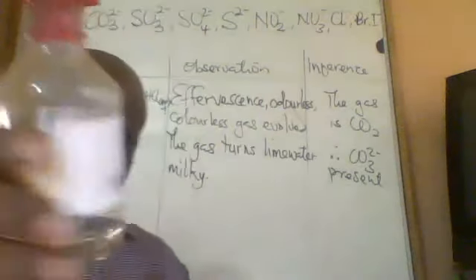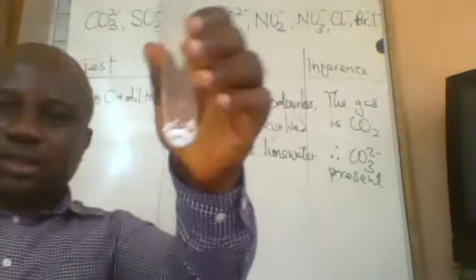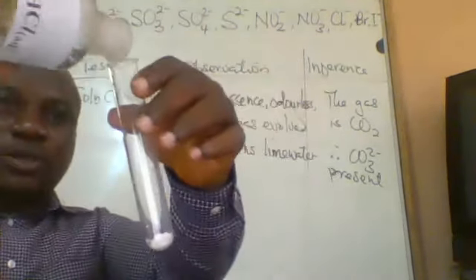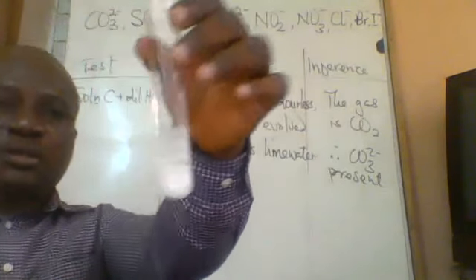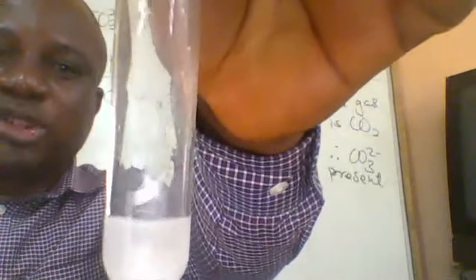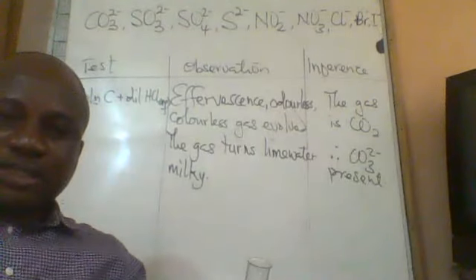This is HCl. I'm applying it on solid sodium hydrogen carbonate. It contains the carbonate ion. Look at it. Did you see it? It fizzes. It's like it's boiling, sort of. That is effervescence.